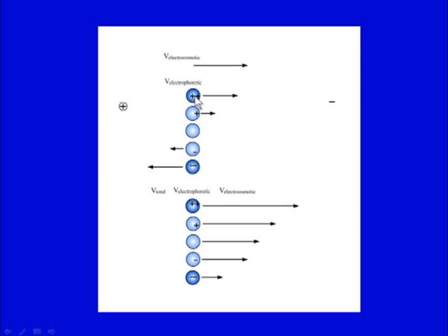For positively charged species, the more positive the charge, the more rapidly it will move towards the cathode, and the less the charge, the less rapidly. So, it is a relative movement or migration depending on the charge being carried by the species.